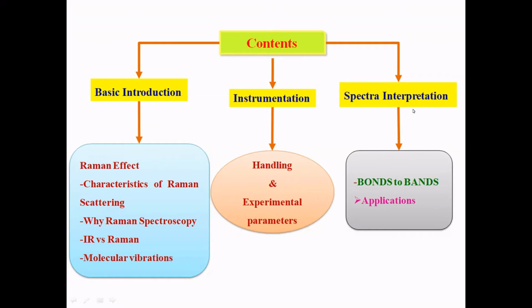And finally, the most important thing, the spectral interpretation. So how the molecule can be predicted, or understanding the structure based on the bands, I mean Raman bands. So I'll be discussing that. And finally, I'll be covering the applications part. So how this tool can be helpful in various domains. So that way I will be discussing.